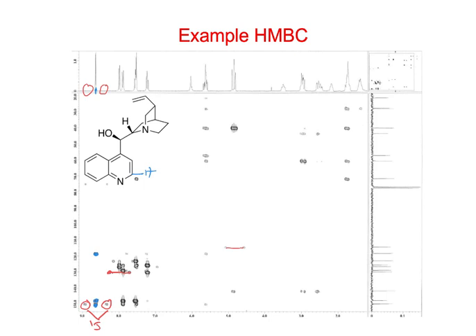So it's something we have to keep an eye out for. I don't have my notes on here. So one thing in here, I think that this is actually the OH peak. And in here, we have two peaks at this position here. Maybe we should go back. So we also see that in the C13 spectrum.